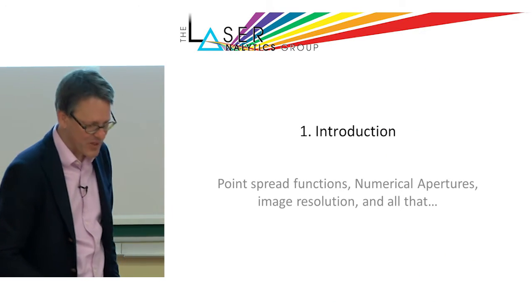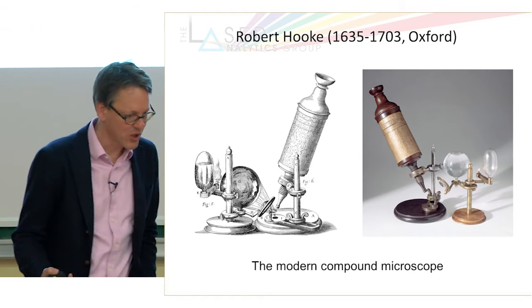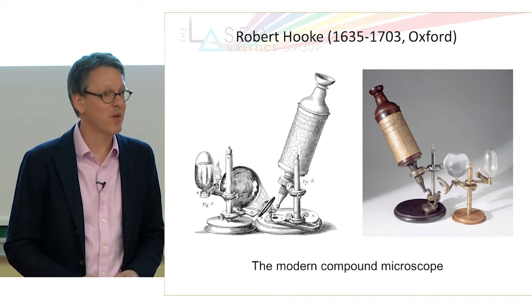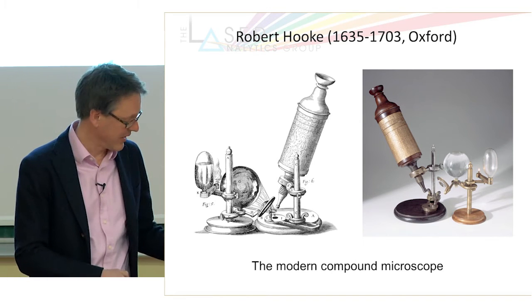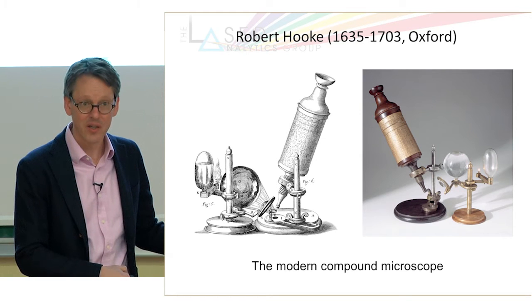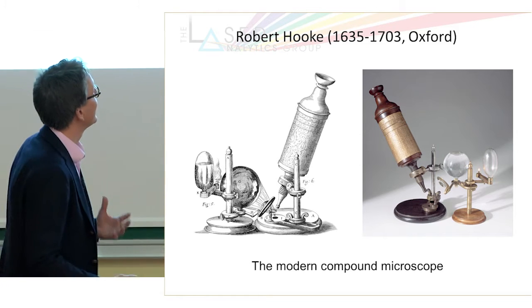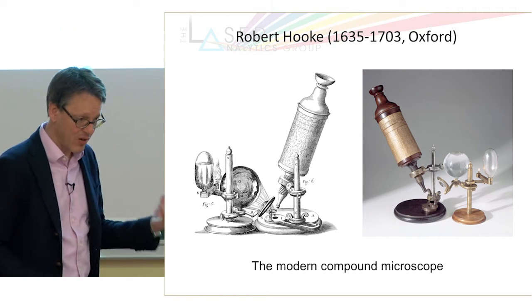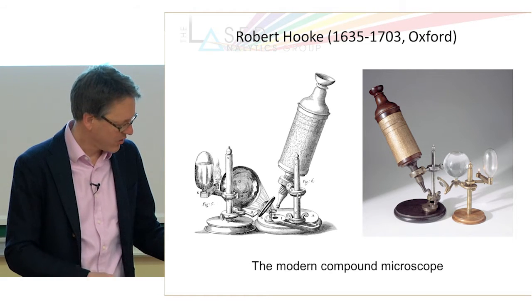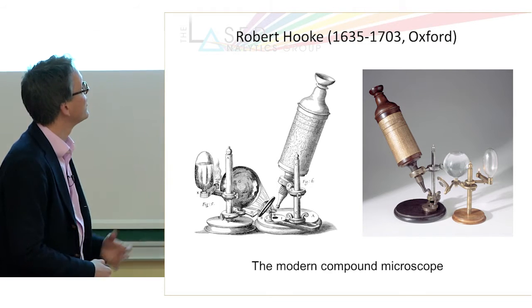So what are we dealing with when we do optical microscopy? If you want to study biology, you want to study living things, living objects, and what better way to do that than using light. If I probe something with light, I can keep it alive if I do it properly. As long as you have an object where you can interrogate molecules specifically and sensitively using the right colors of light, then you can use optical microscopy and you can look at small things.